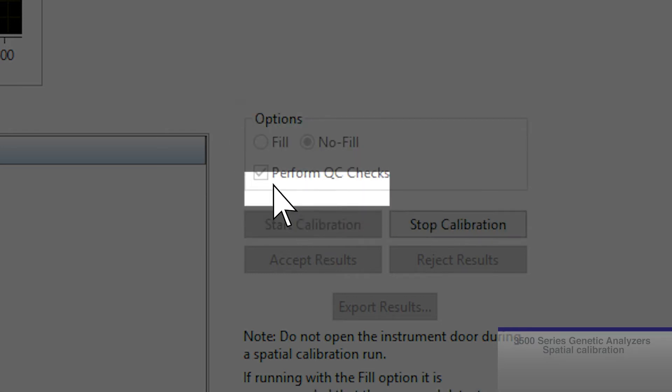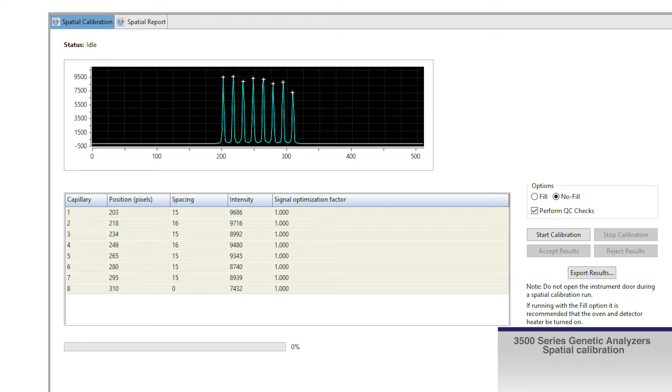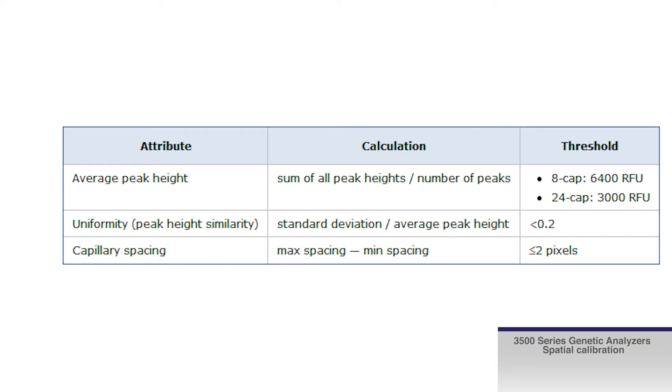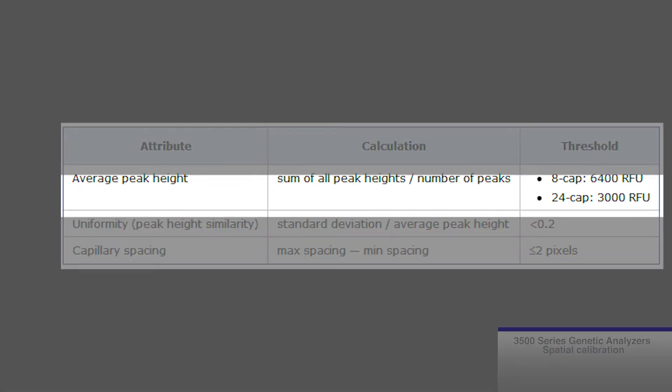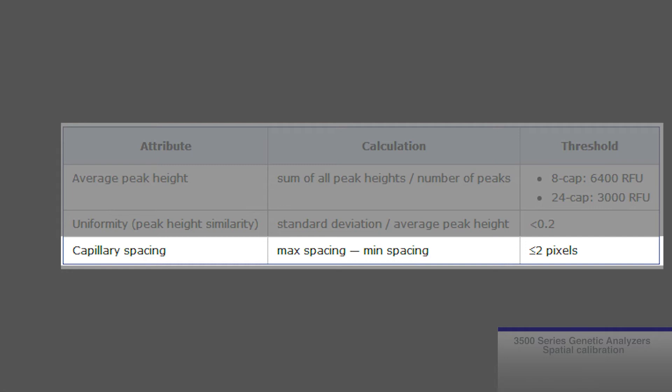Select the performed QC checks if you want the system to check each capillary against the specified range for spacing and intensity. During the calibration, if the performed QC is checked, the software will calculate average peak height, uniformity, and capillary spacing.